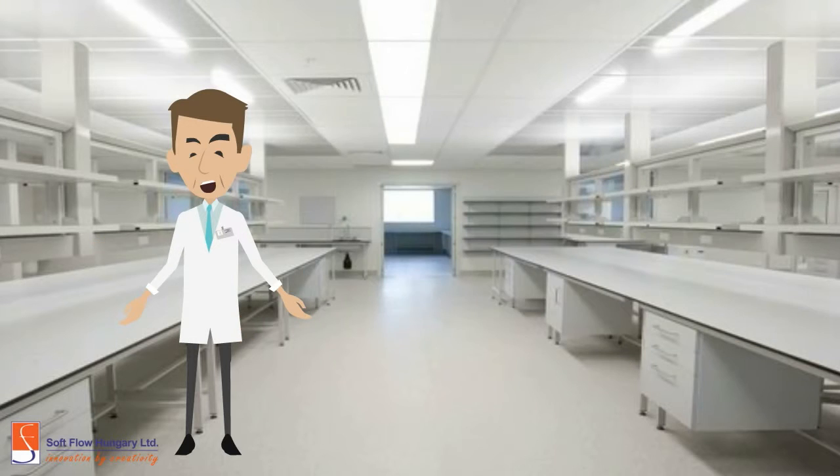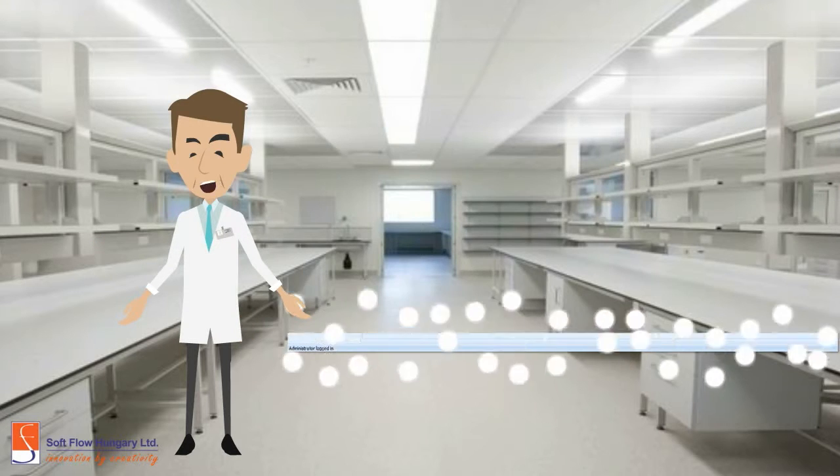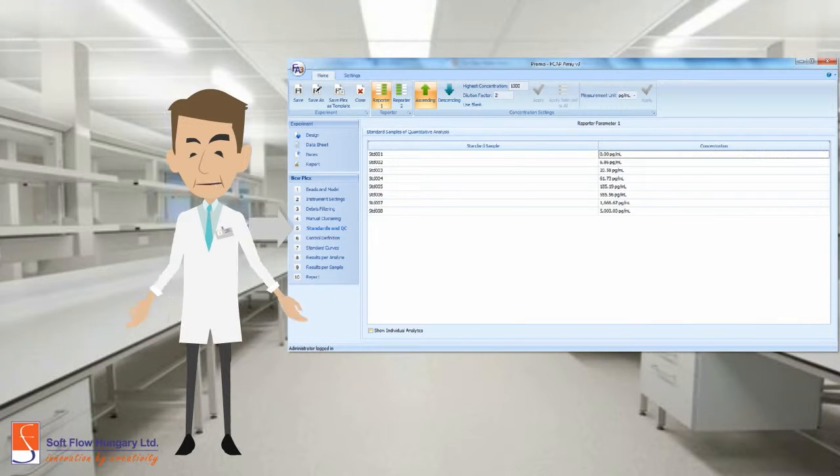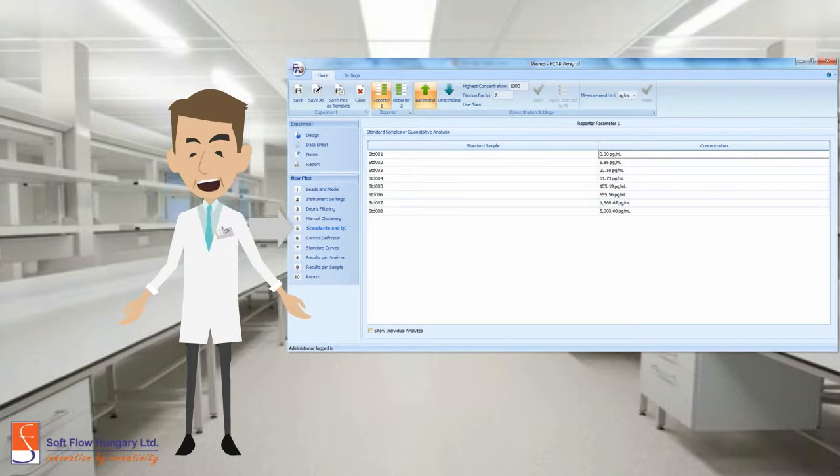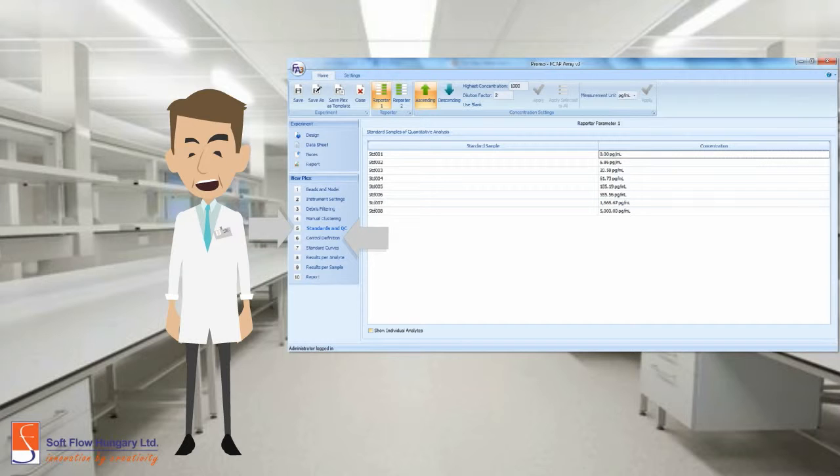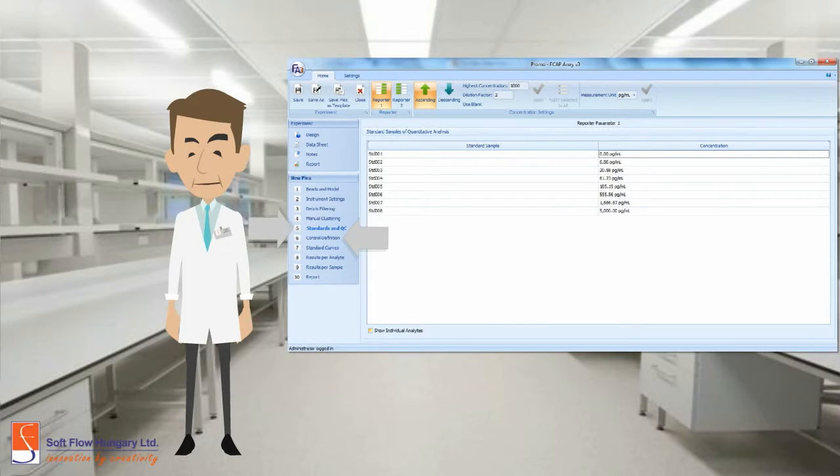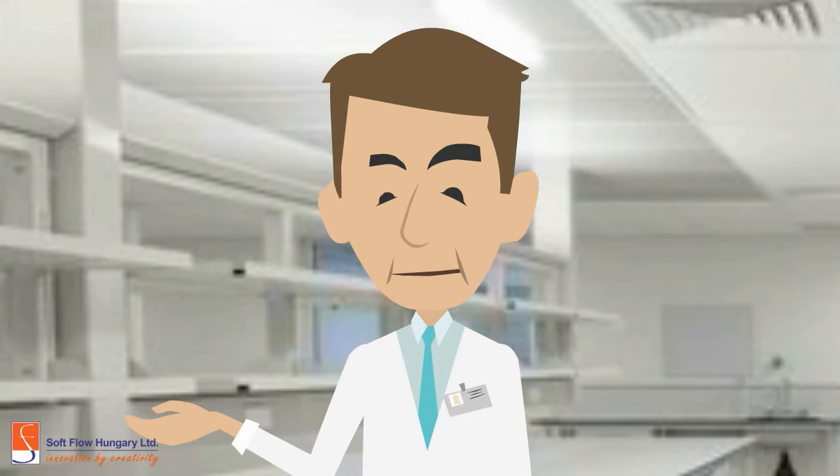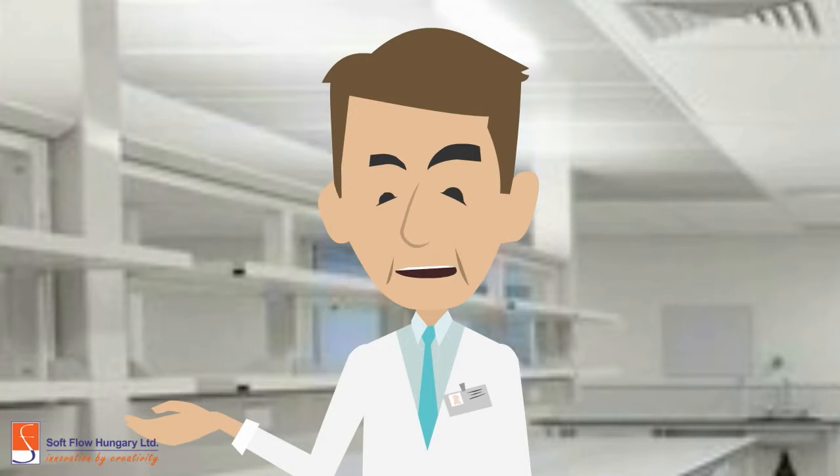Then, you can define the standards and quality control. Set up the concentration and the dilution factor. You can also change the control definition when using controls. Therefore, you've finished the data input steps. Next part is the analysis.